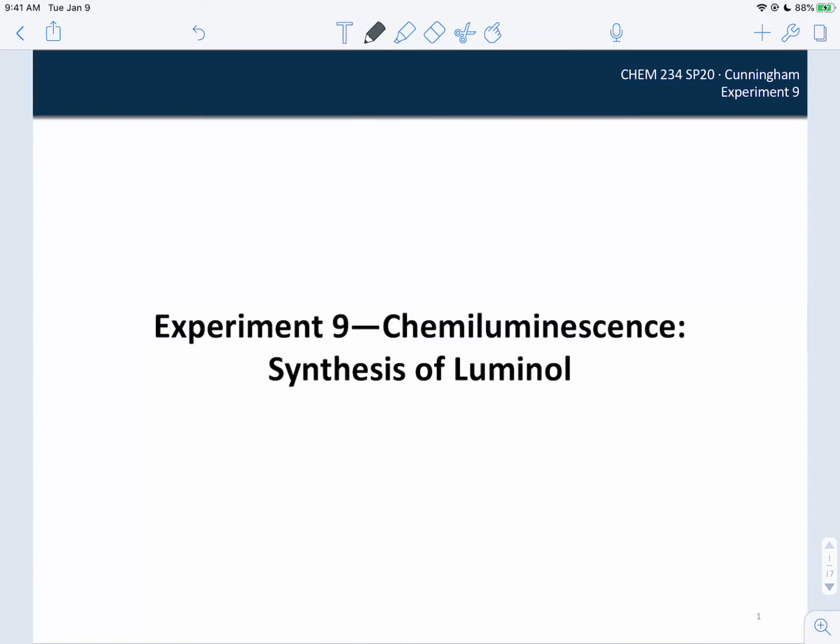Well, we've reached the end of the road in Chem 234, and we are going to end our discussion with Experiment 9, which deals with chemiluminescence and the synthesis of luminol.